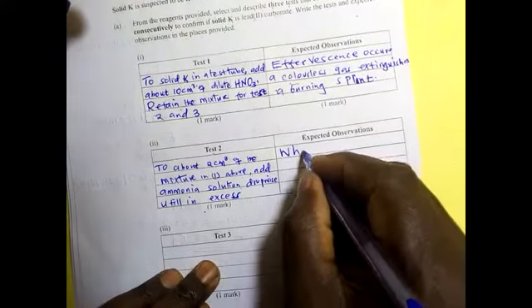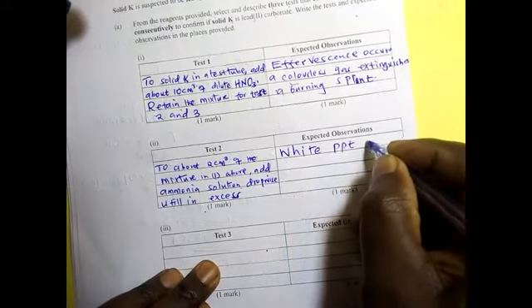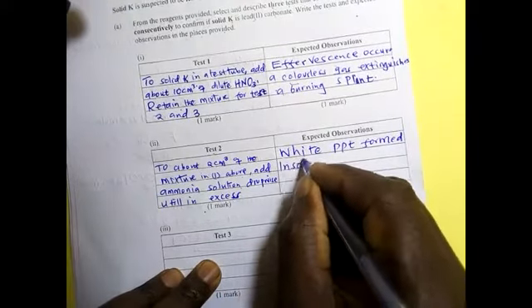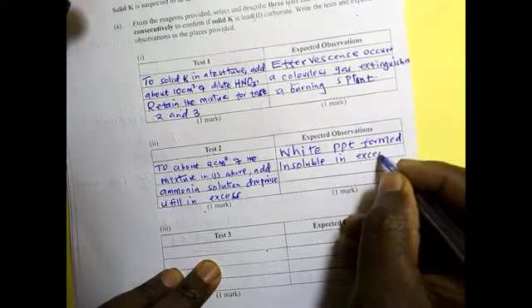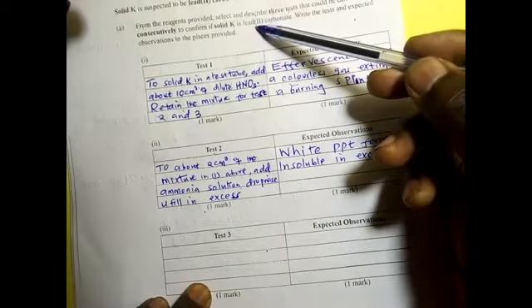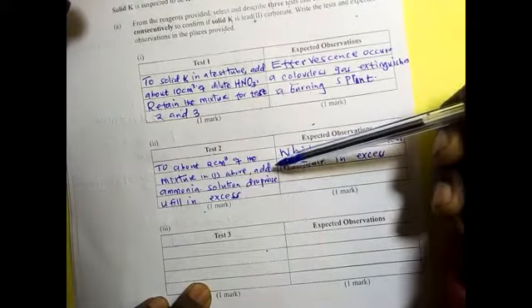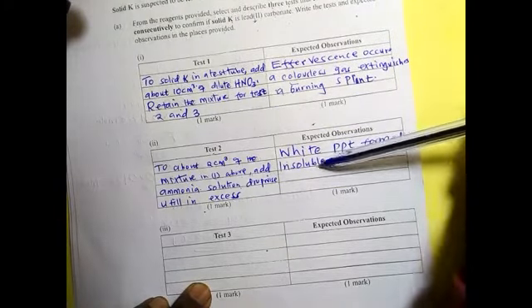So a white PPT is formed, insoluble in excess. Yeah, because we know that if it was lead, it will form a white precipitate which is insoluble, that is ammonia. But if it was zinc, it will form a colorless solution in excess.